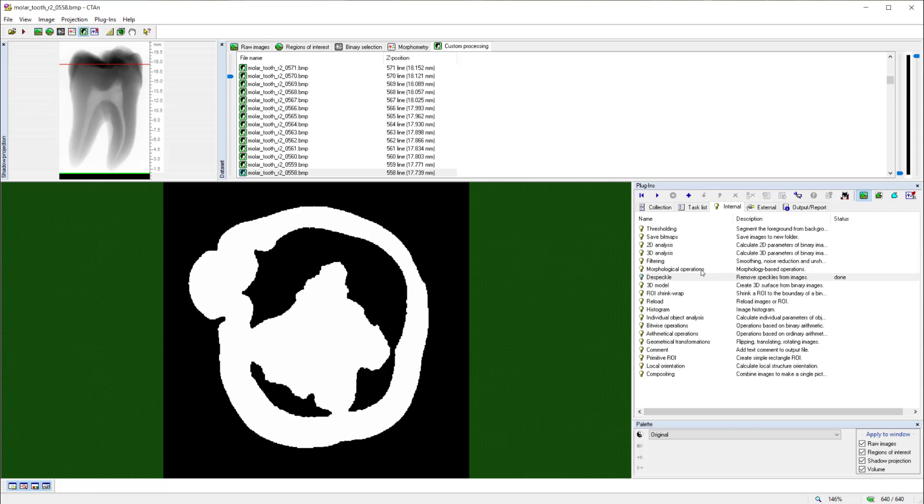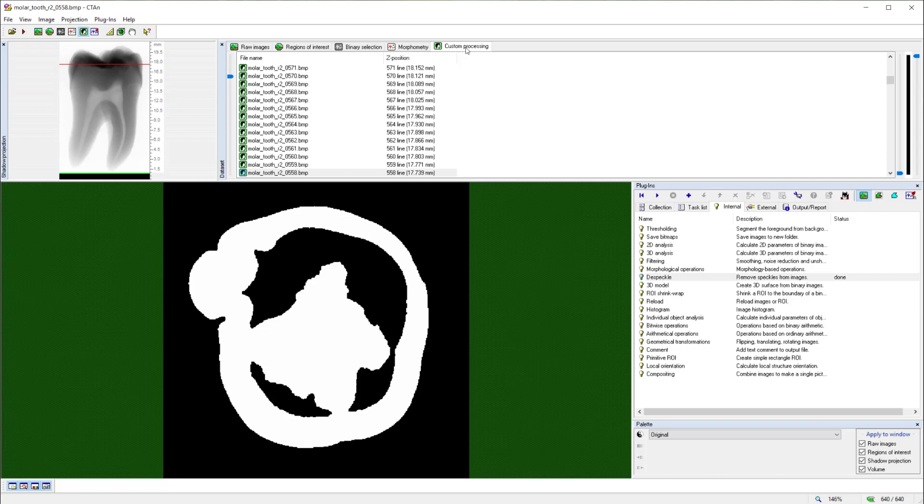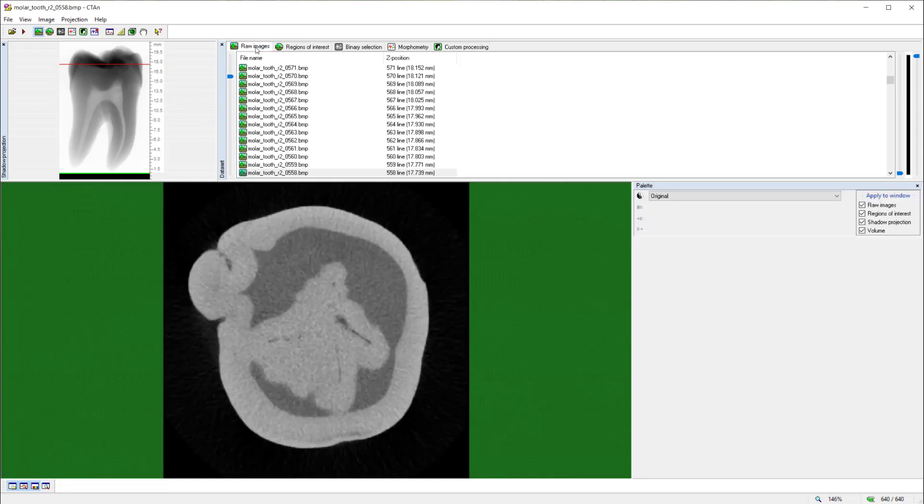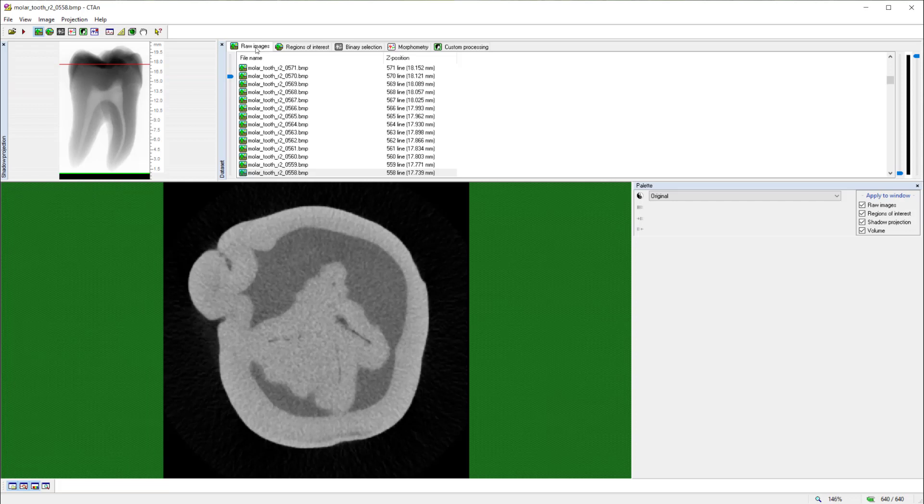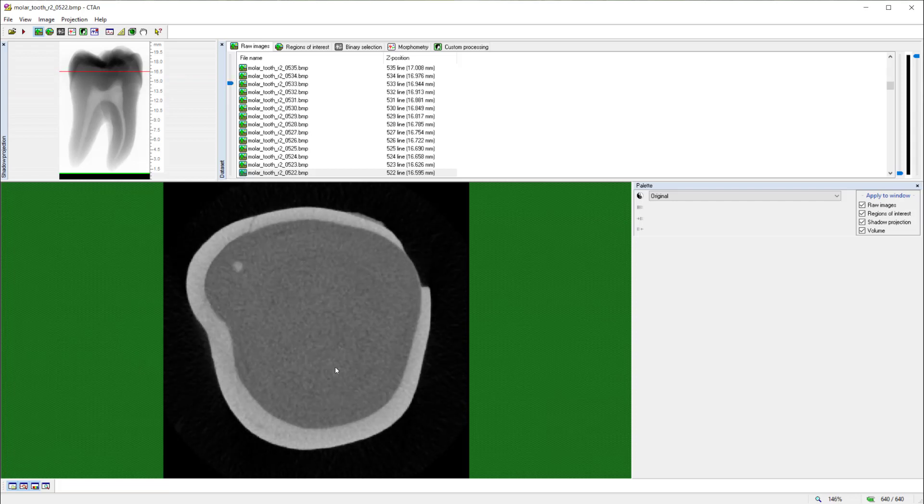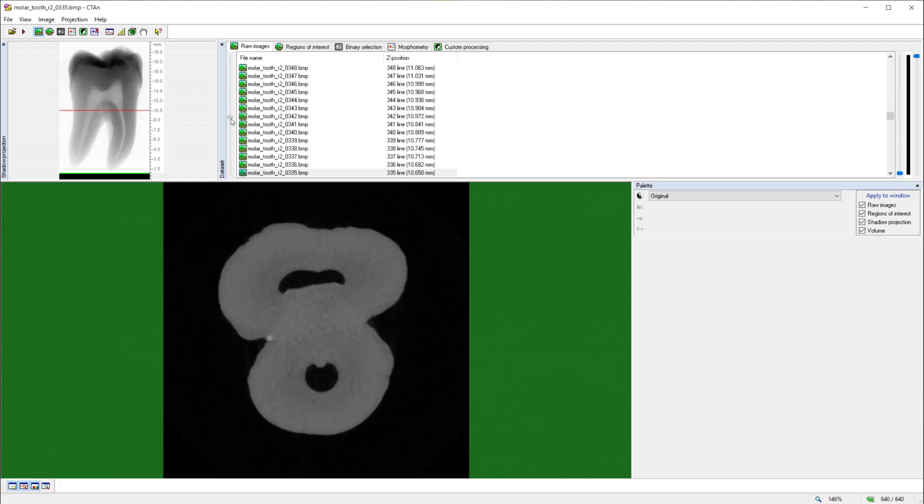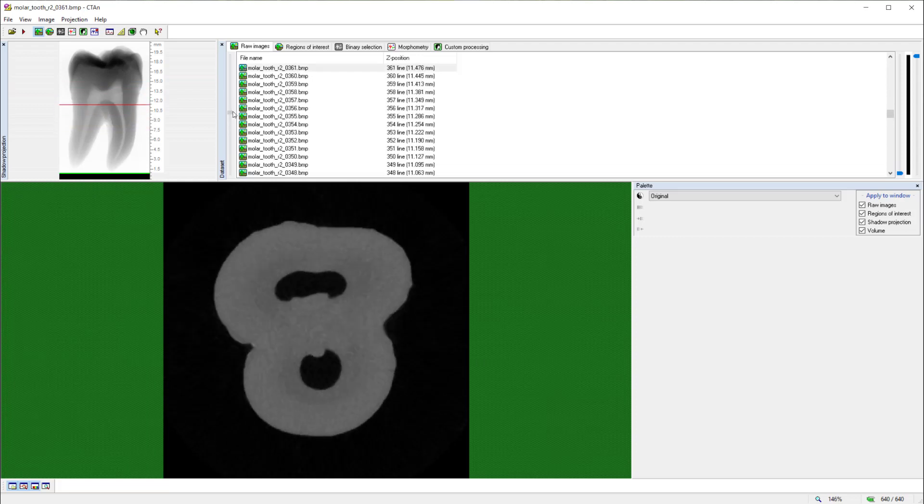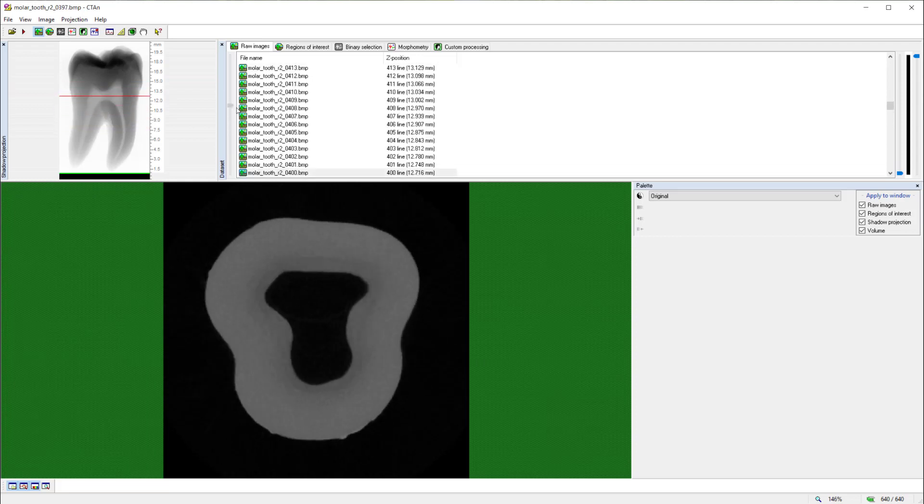So that is an overview of the five pages of CT Analyzer: the raw images page, region of interest page, the binary selection page, morphometry page, and the custom processing page. To illustrate further how these pages work together, let's take the example of a simple quantitative analysis of our tooth. The tooth consists of three phases of interest to a dental researcher. They are the enamel, the high density layer around the outside at the crown of the tooth, the dentin, which is the bone-like filling or the main body of the tooth, and there is a root canal in the center.